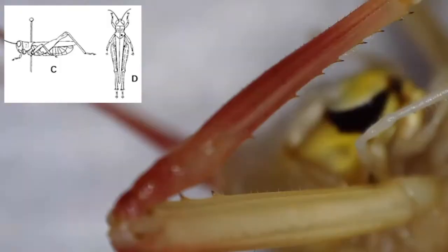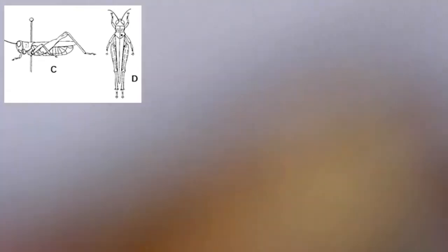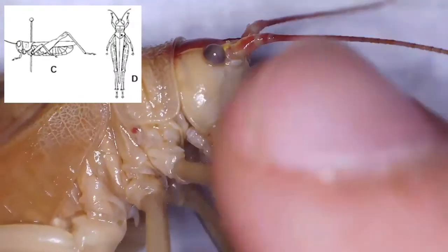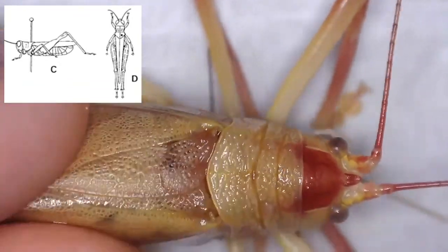Our next insect is going to be a rather large one, so going to the other end of the size spectrum, this is about an inch, maybe an inch and a half long, and this is a katydid, which is going to be a member of the order Orthoptera. So a rather large insect with pretty clear segmentation, and you are going to pin Orthopterans slightly right of center of the pronotum.